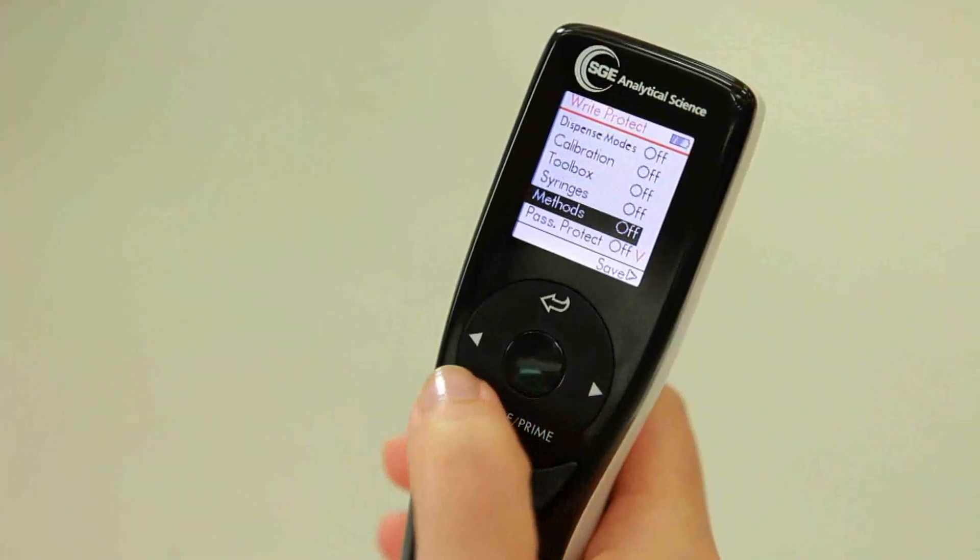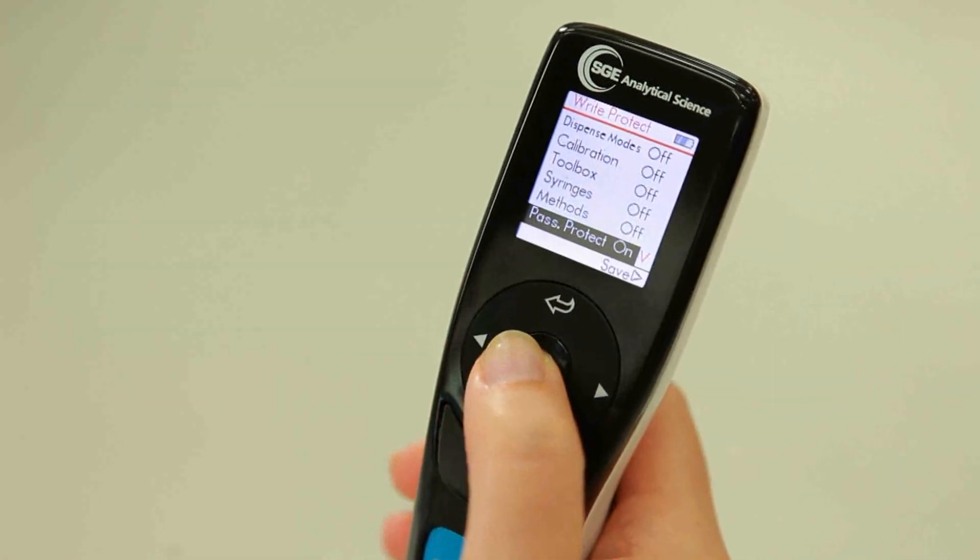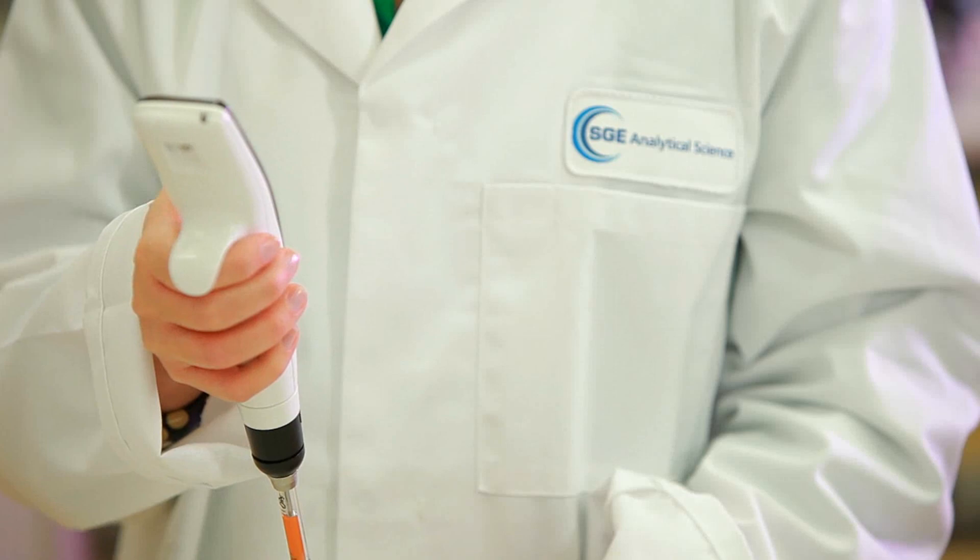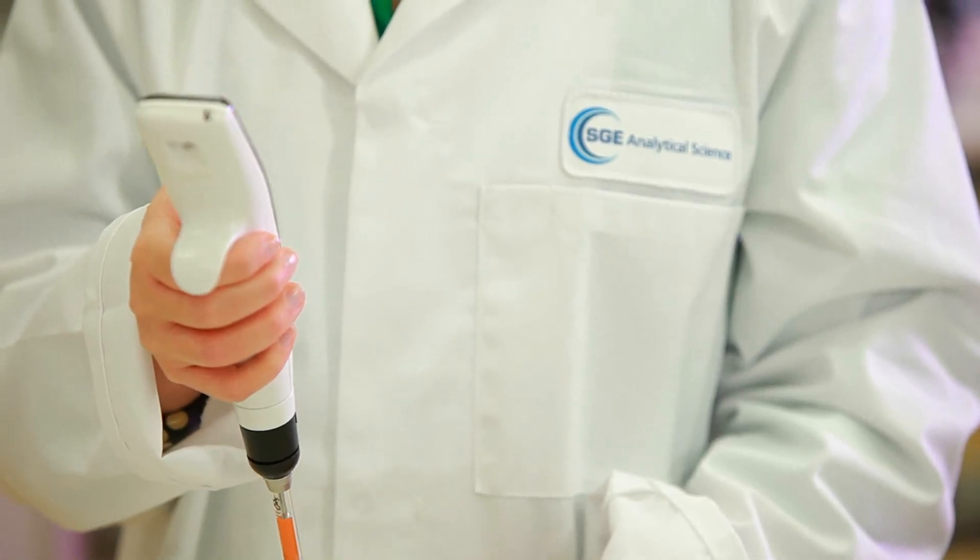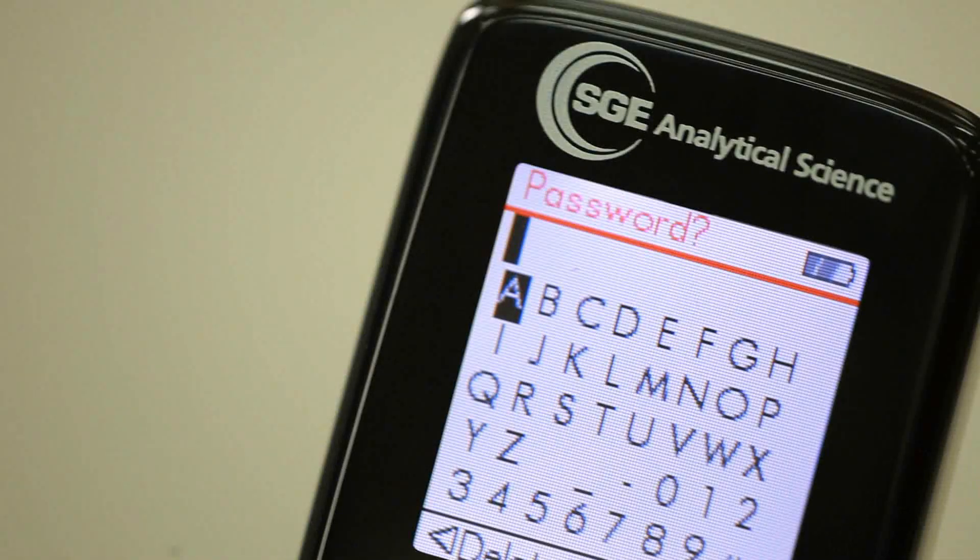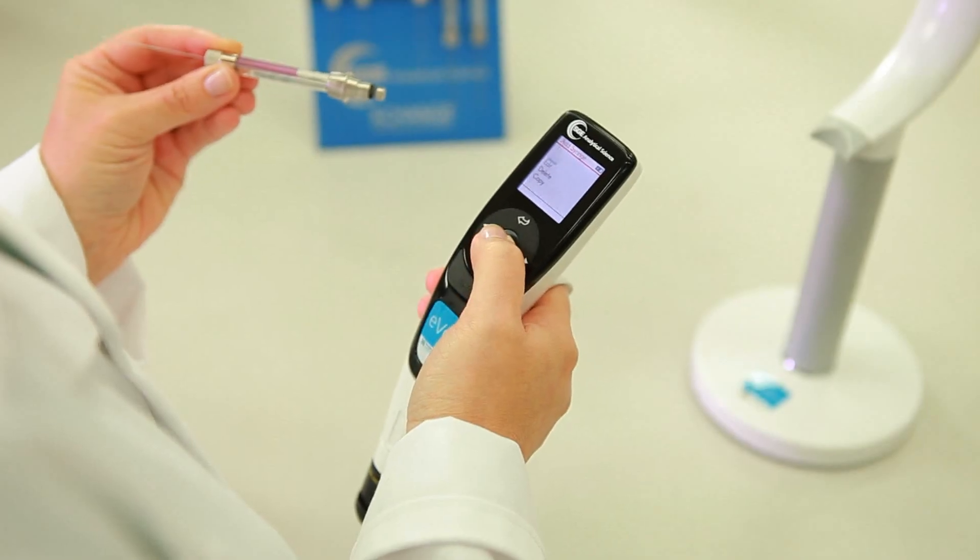To set a password, turn the password protect option to ON and press SAVE. Enter the desired password into the password entry screen using the scroll wheel and press SAVE to set the password. Once set, this password will need to be entered every time the Write Protect menu is accessed.